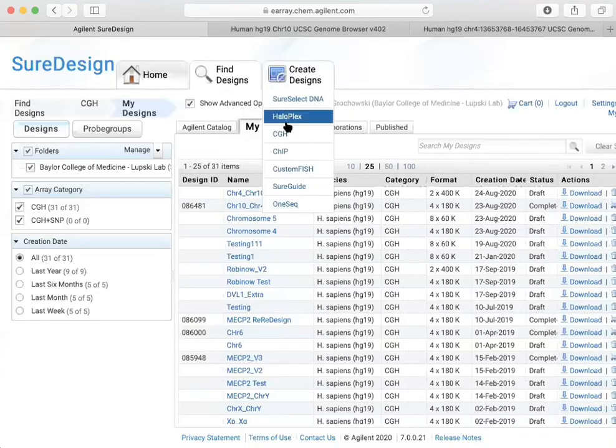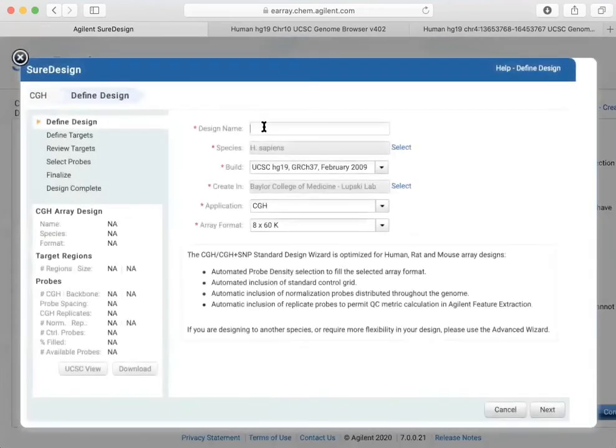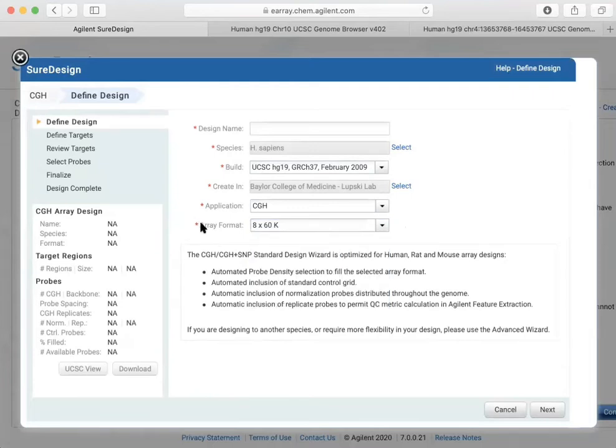Let me go back to the aCGH, the standard experimental setup, where you can target chromosomal arms, whole chromosomes, or specific regions. It's really just a choice of what design you want. I wouldn't do a 1 million. We just don't need to, unless there's a very specific region.